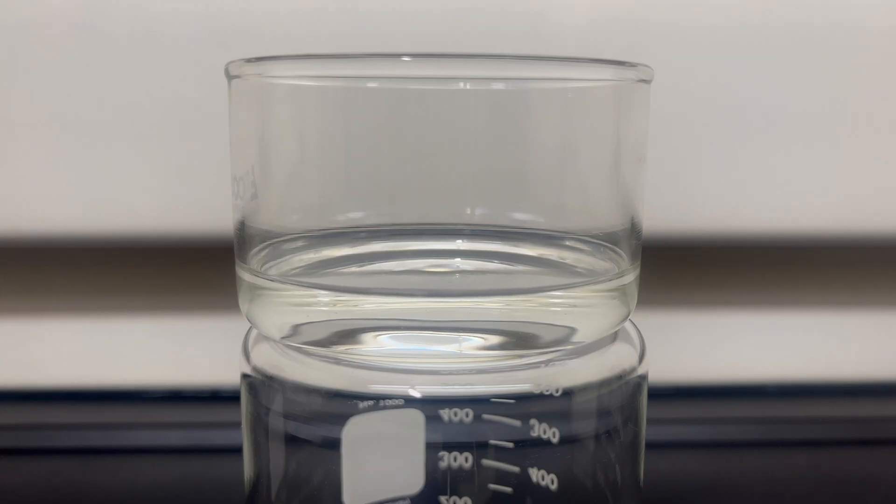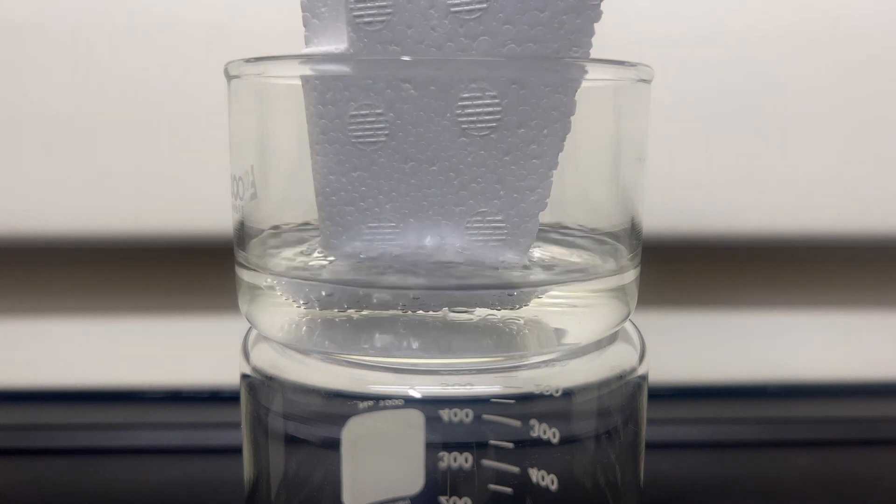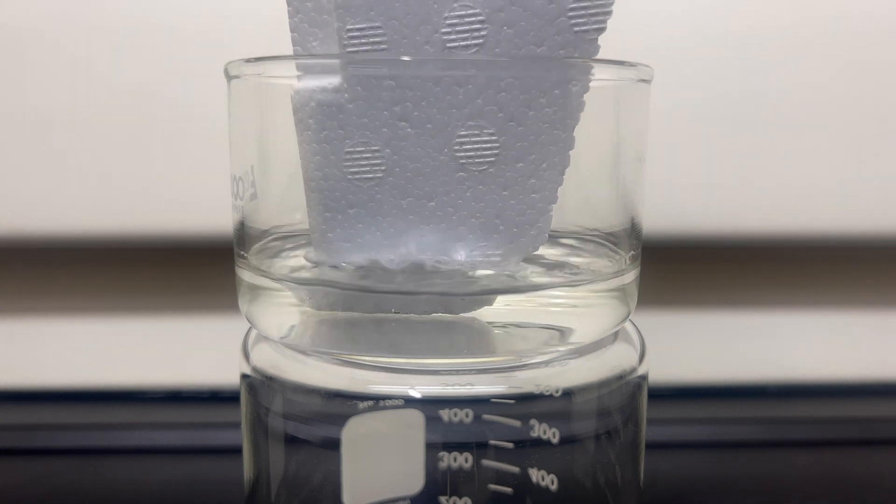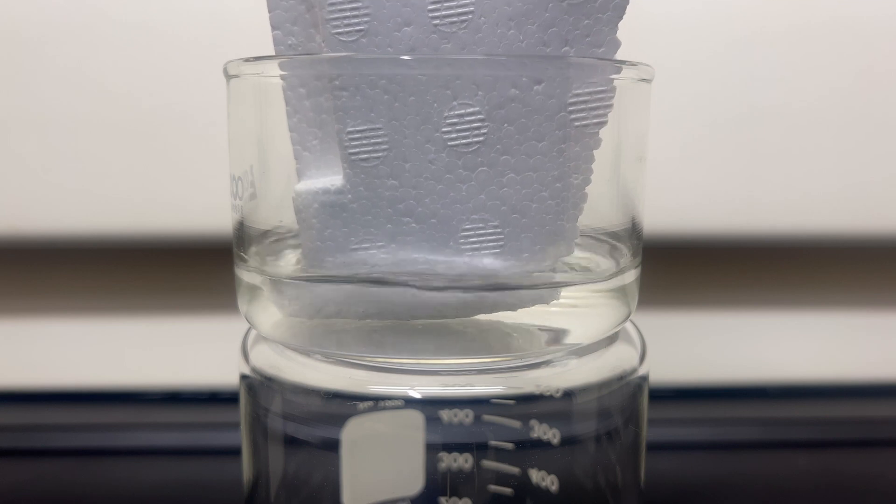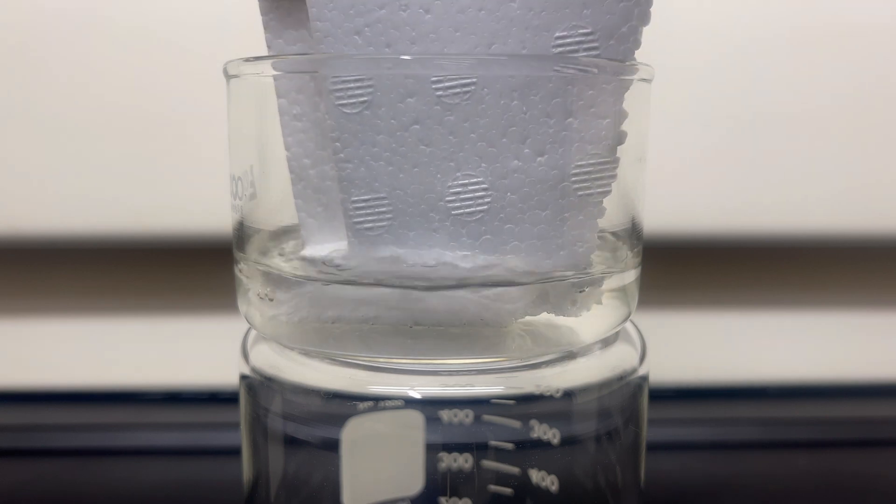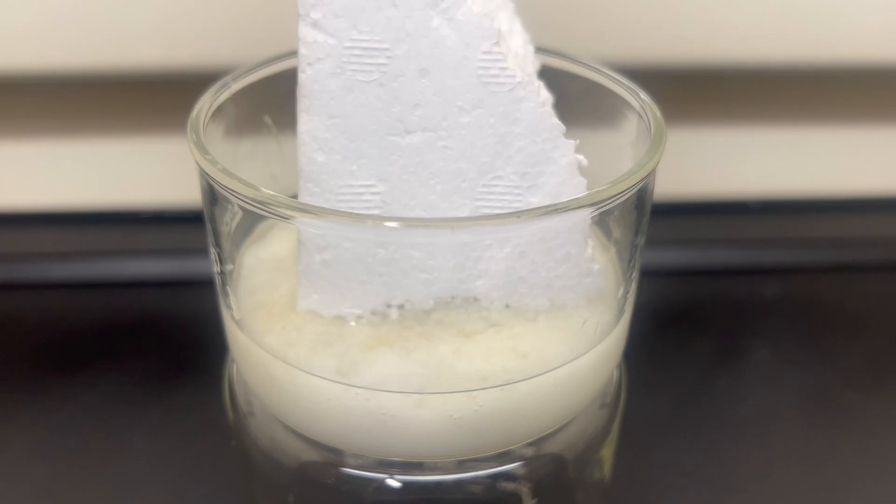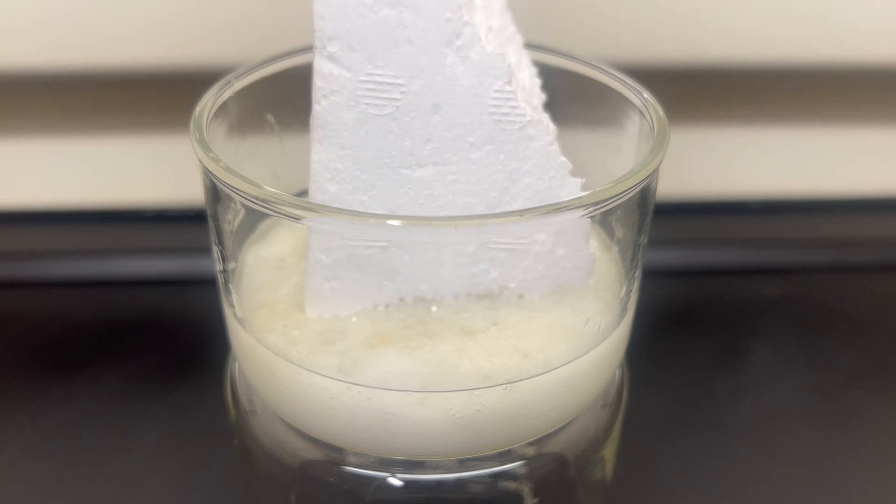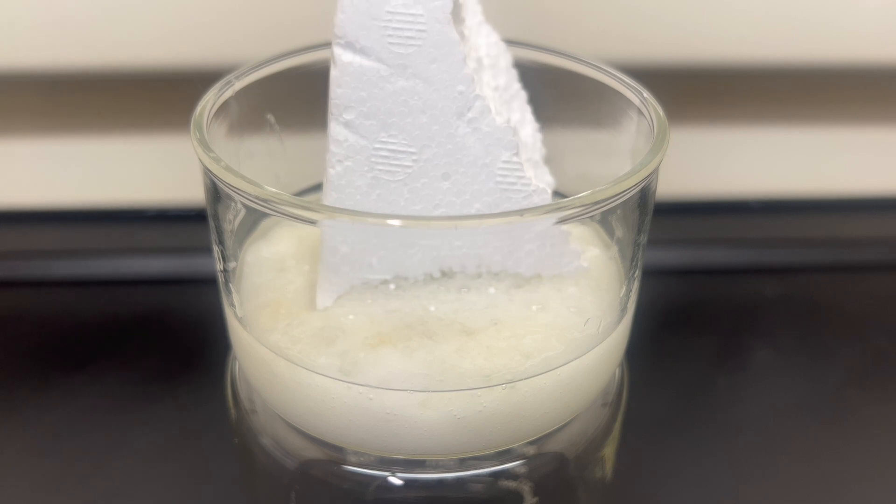First things first, polystyrene is generally found in its expanded form, whipped full of air, making it super light and giving it nice insulative properties. But this is not practical for filling up a reactor. By using a solvent such as acetone or a similar hydrocarbon, one can dissolve polystyrene into a goop, releasing all the trapped air.